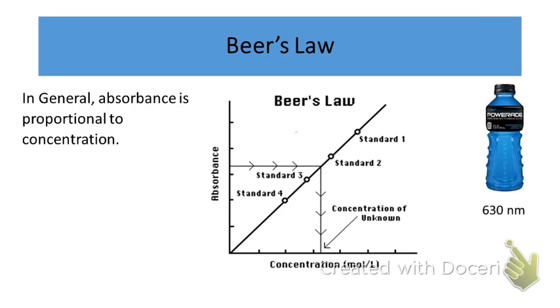All right, so we know basically 4 known concentrations. Those are our standard solutions. We know their concentrations. We measure their absorption using a spectrophotometer. Then we graph their absorptions versus their concentrations, and we should get a straight line. A straight line, like this.